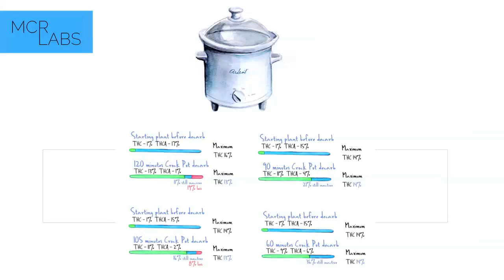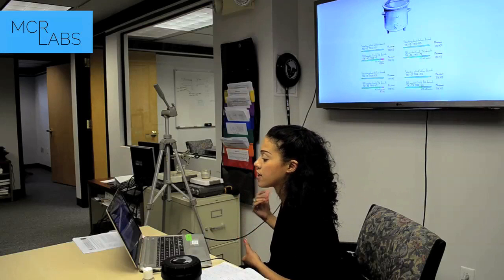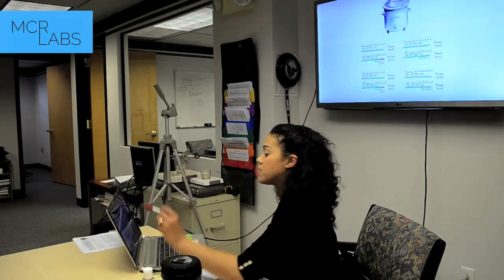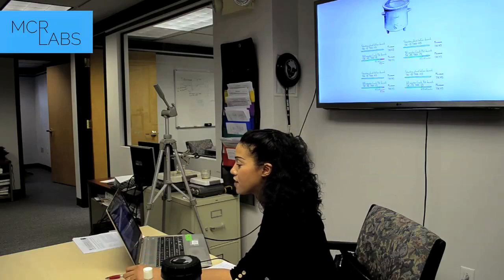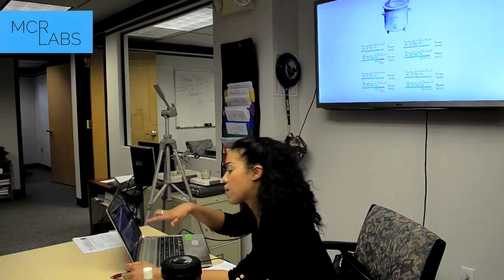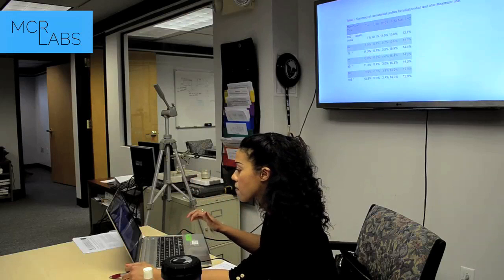And so the illustrations and pictures you see are actually from a decarb guide that we put together, which is a synthesis of some of the testing that we've done here. That's available online for anybody who wants to look at it, so I will let you see that. But I also have some of the raw data behind this that I thought would be cool to share with you guys, since we're doing a deeper dive into the science of decarb. So I'll just talk to you a little bit about it first. You can see, actually we'll just go to the raw data.